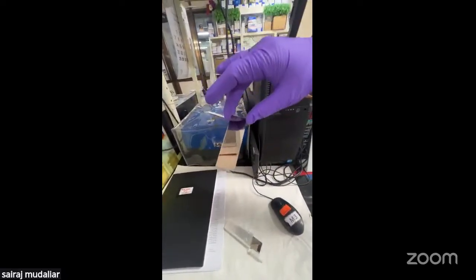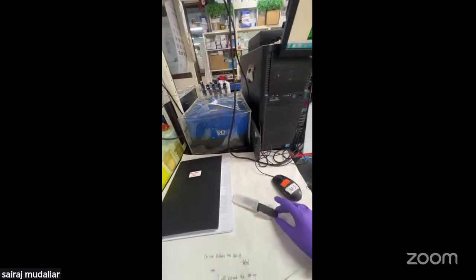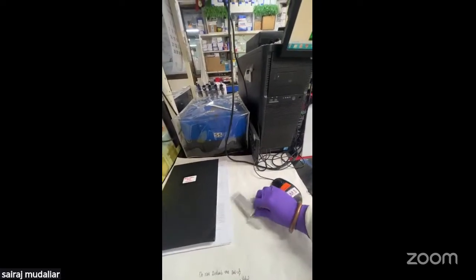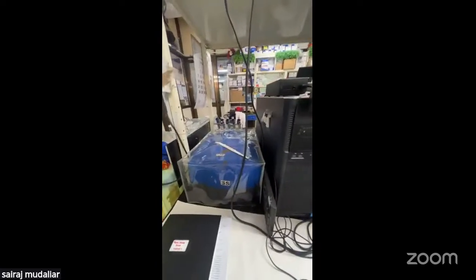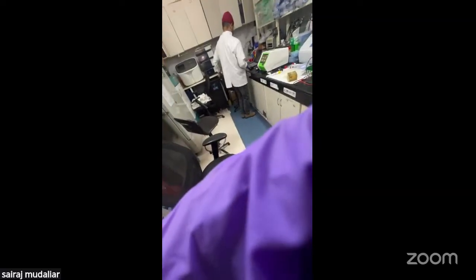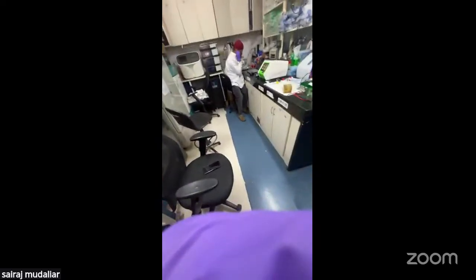So these are the UProt chips. The proteins are imprinted, and once the proteins are incubated, you can easily scan it in the scanner. So this is the protein microarray scanner, and this is how the scanner looks. So coming back, I will just flash through this slide.